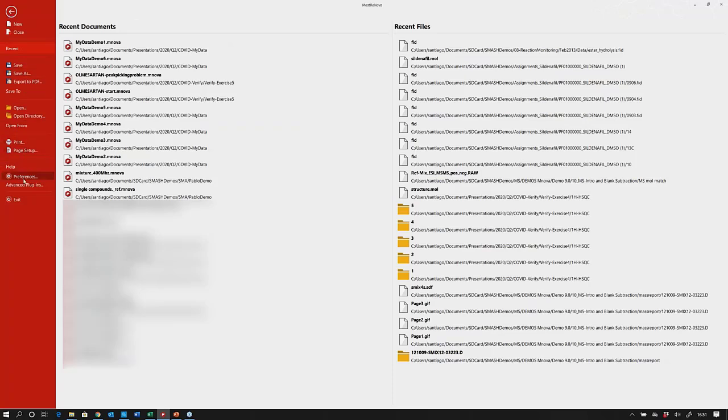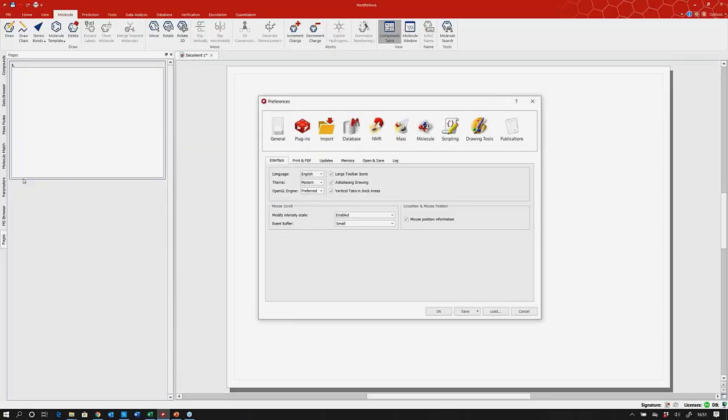Preferences, which is the third one from the bottom. And this will pop up this dialog. Here, in the very first General tab, Interface, you will see that you have Theme, and the theme is either Classic or Modern. So you should choose Modern, and you should choose OK.